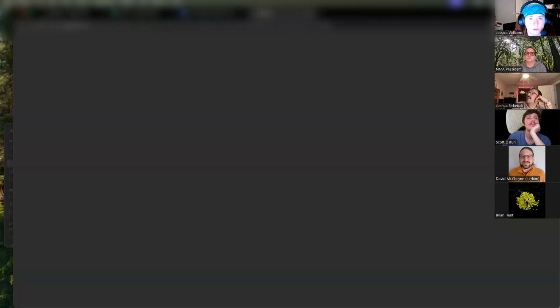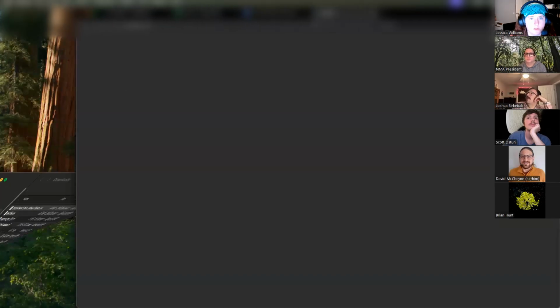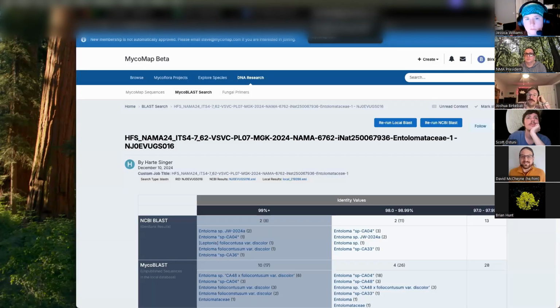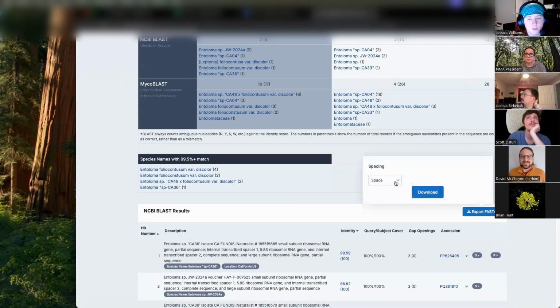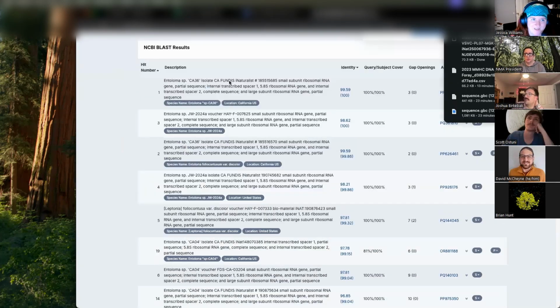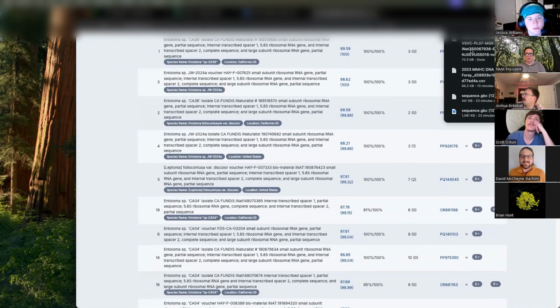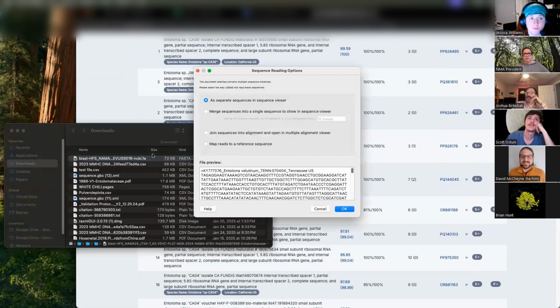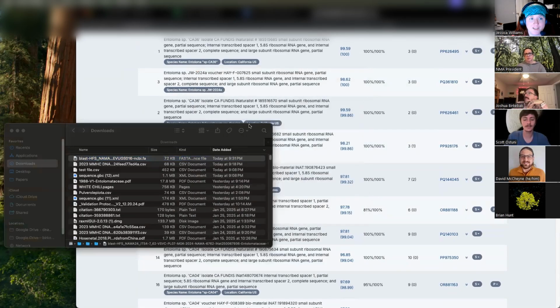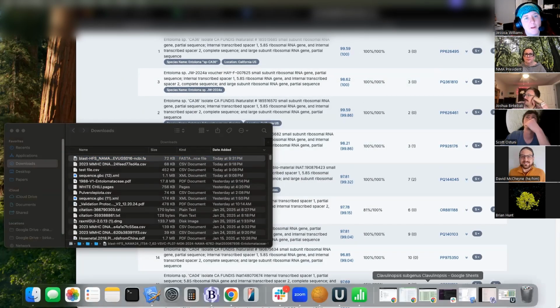Because I think I have done this a long time ago, downloading straight out of that. You can also download straight out of NCBI BLAST as well, so you can do the same thing. You'll probably have less mushroom relevant data. But for a quick and dirty tree, not a paper but just a tree, just to see if like 36 and CA4 are really different, we can probably just open it up and do that real quick. There is going to be a lot of duplicate data for some of these between GenBank and the local BLAST, because of uploading stuff. That's kind of another crappy thing.